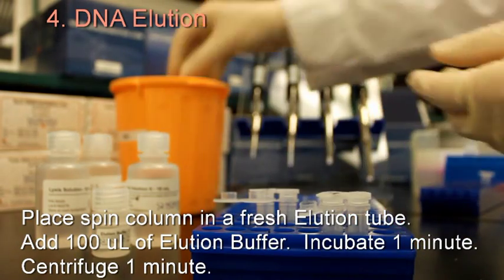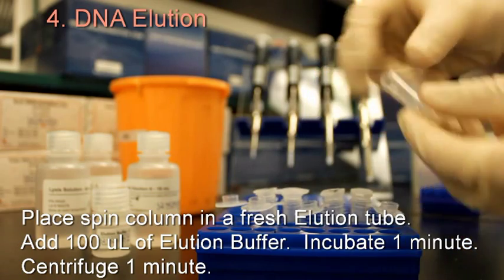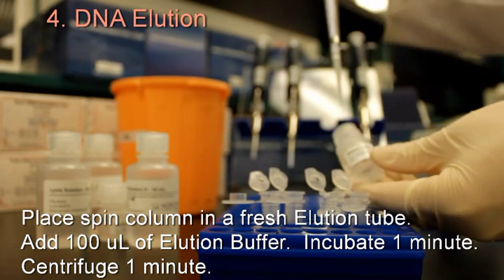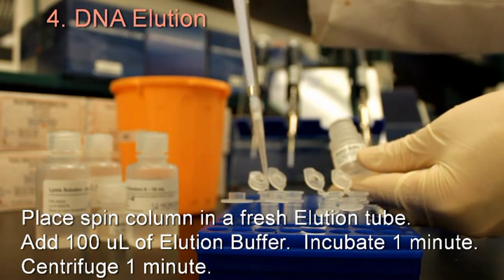Place each spin column in a fresh elution tube. Add 100 microliters of elution buffer to each spin column. Incubate 1 minute and centrifuge 1 minute.